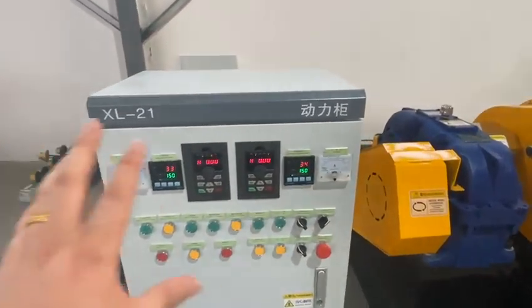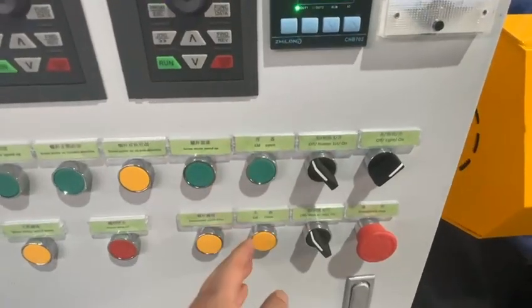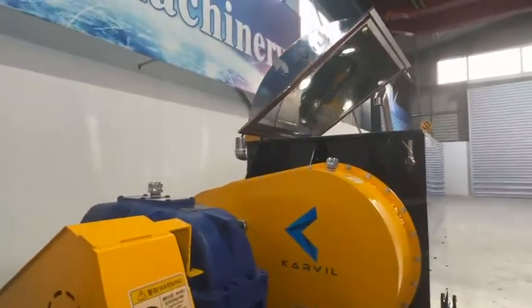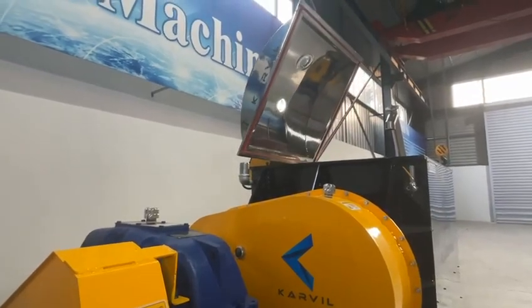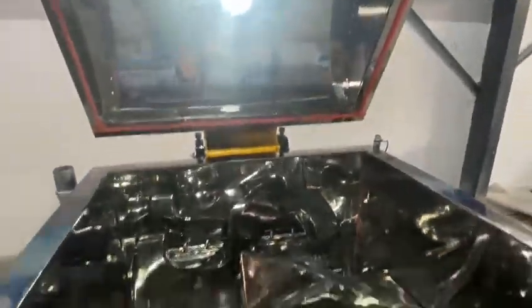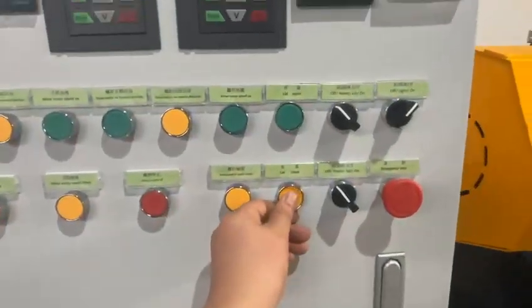First, we test the lid open and close function. This is the lid open and the lid close. Now the lid is open via the hydraulic system. This is the inside situation — double Sigma blades and discharging screws, mirror polish and stainless steel. And then we close the lid.